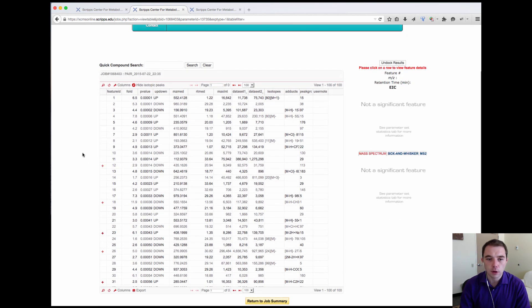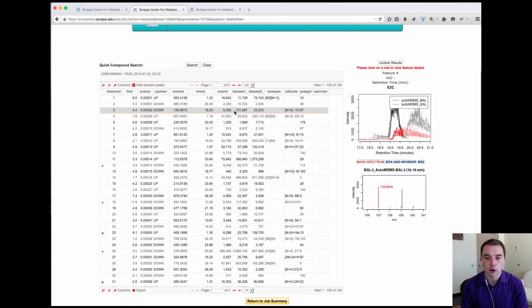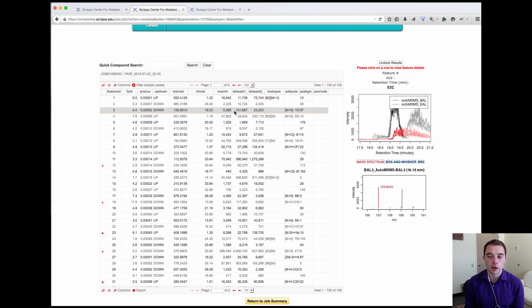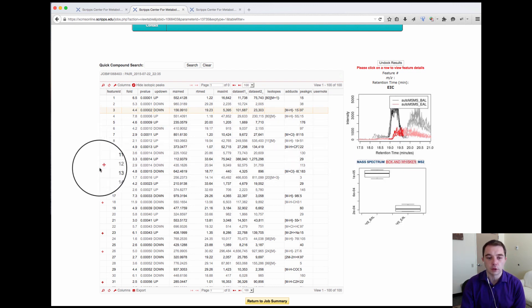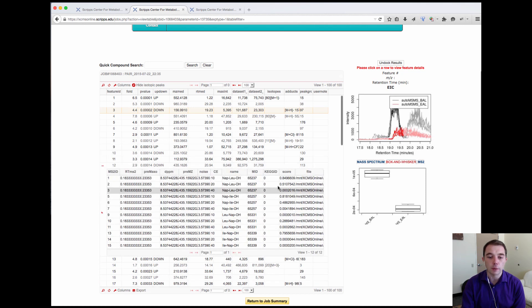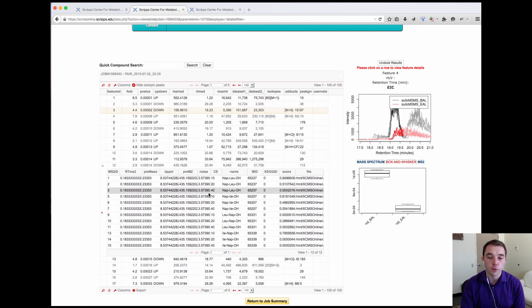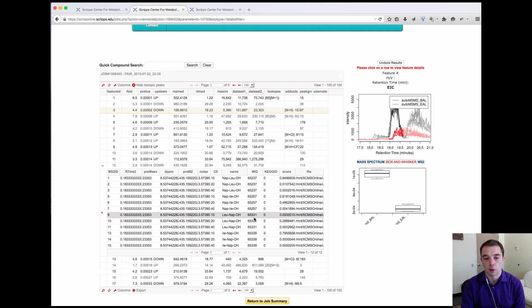You can see if I click on my features I get my EICs and my Spectra plots, my Box Whisker plots, but you'll also notice that there are these plus symbols down the side here and if I click on one of the plus symbols I get a whole load of new data which comes up.